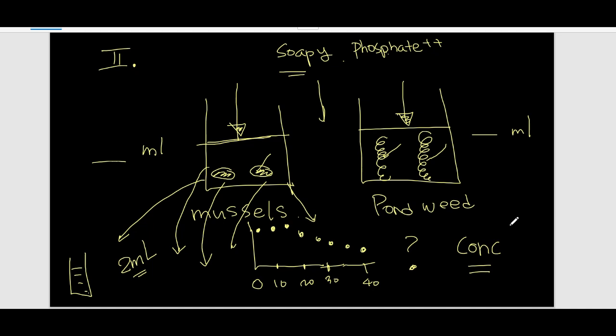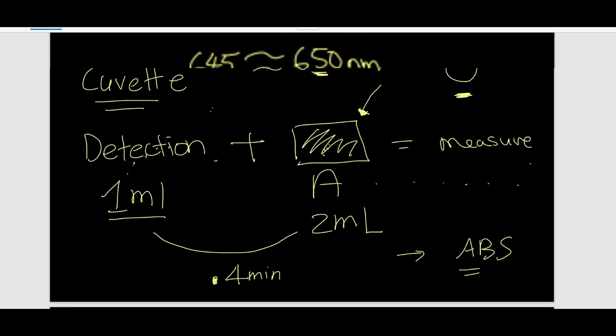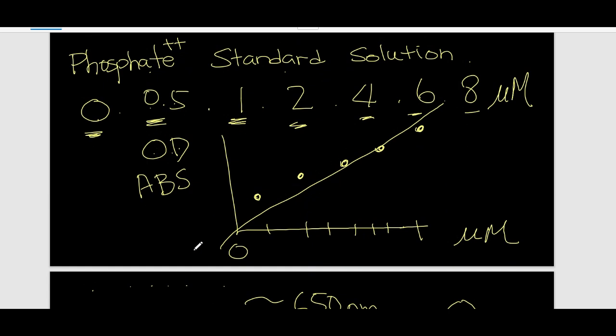Okay, so I hope this makes sense. And next lab, we will have the actual data. Then we will use an Excel spreadsheet, and we will learn how to plot the graph, and we will learn how to plot this standard curve, and we can also calculate the slope of this curve, and then you will get a y equals ax plus or minus b equation.